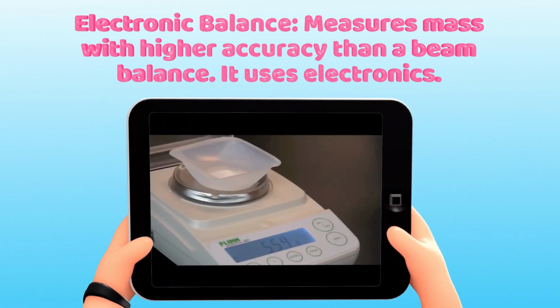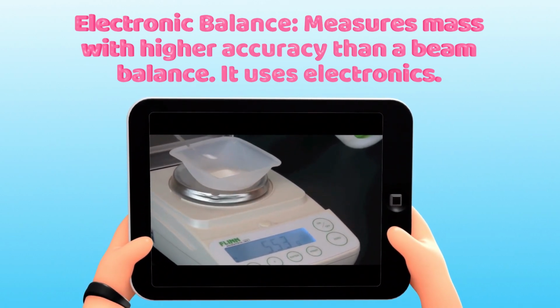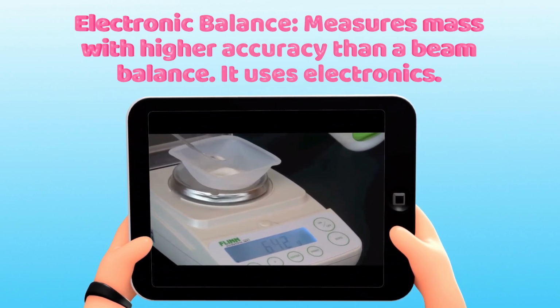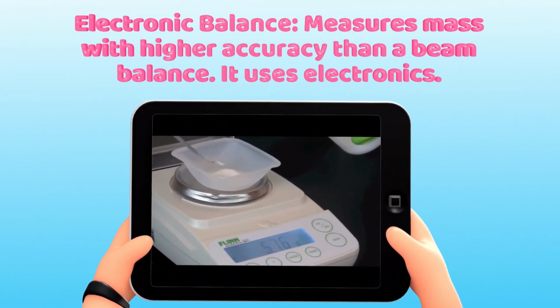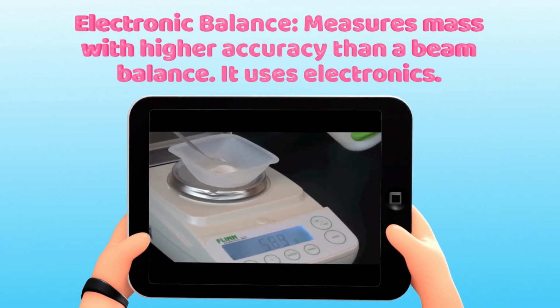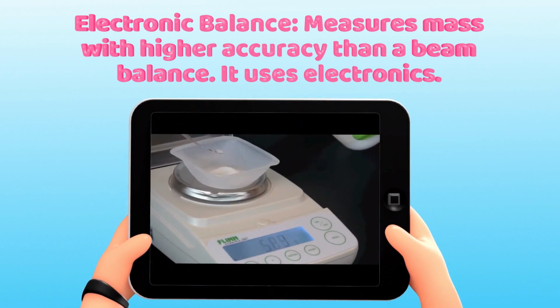Once you put it, remember it will have some weight, so you must press the 0 so that it is reset to 0. And then you will read the readings as they appear on the screen. That is the way we read the electronic balance in the laboratory.